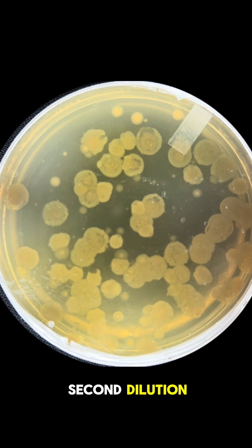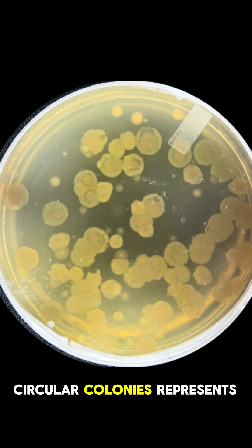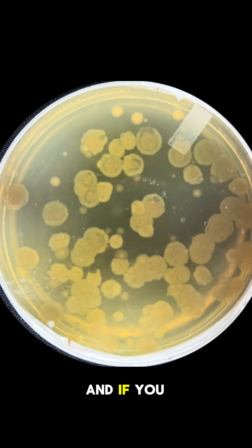This is the second dilution, which means each of those circular colonies represents 100. If you do a quick count there's at least 50 here, meaning there's at least 5,000 colony forming units per milliliter — which is at least 10 times the amount that's considered safe.